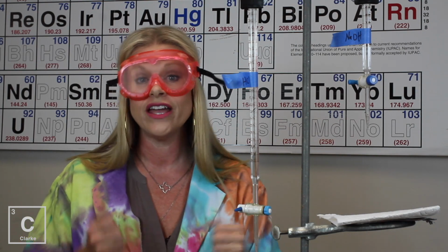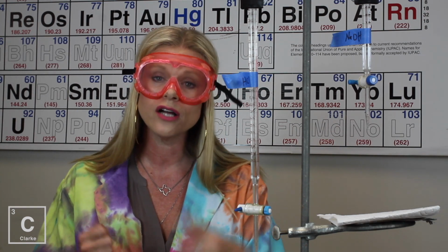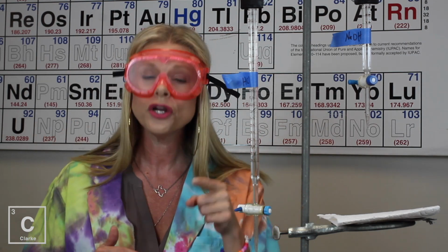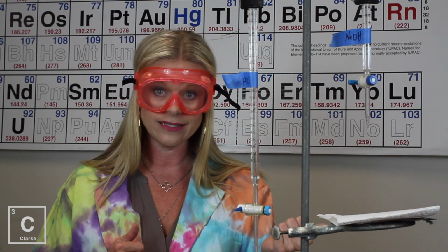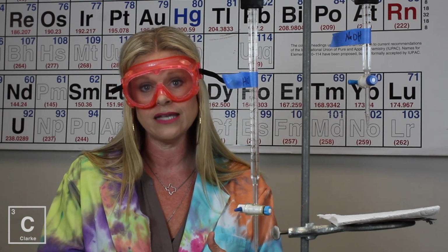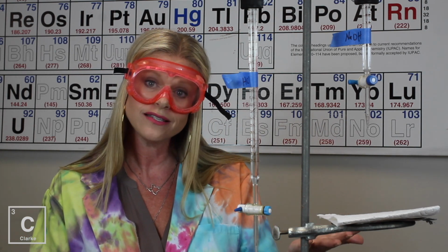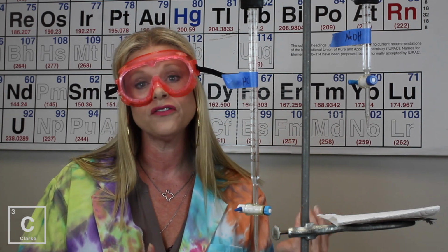Let's say that you have a known concentration of acid and you have an unknown concentration of base. Well, in previous lessons, we've talked about that neutralization reaction. When you add an acid and a base, it neutralizes and makes a salt and water. We're going to use that phenomenon to figure out an unknown concentration of a base. Now, you could do the flip-flop. We could know the concentration of the base, and we need to figure out the concentration of the acid. It can go both ways. But in my lab setup here, I am going to figure out the concentration of an unknown base.